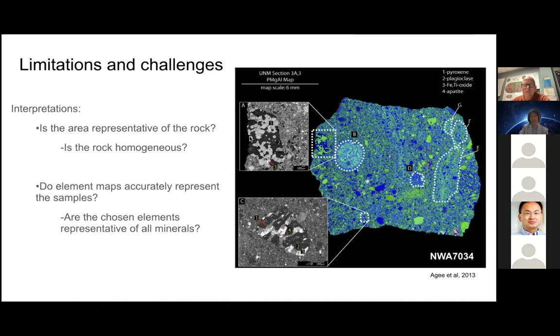So in the previous examples, we had an ideal case where we're measuring the minerals and their compositions from homogeneous rocks. We infer that the image or map that we've created is representative of the entire rock sample, which is commonly true of some types of igneous rocks. In this case, we can't make that same inference. So things like the volumetric abundance of minerals kind of fly out the window in an example like this.